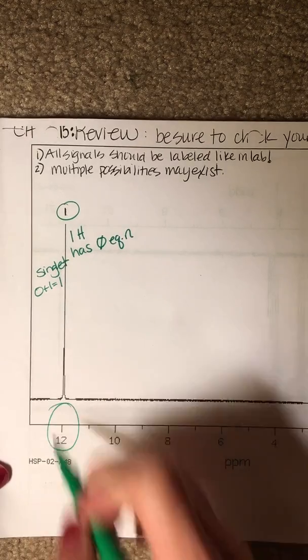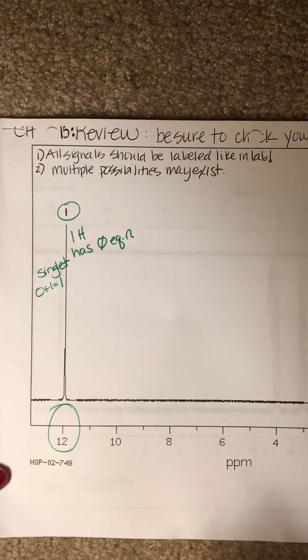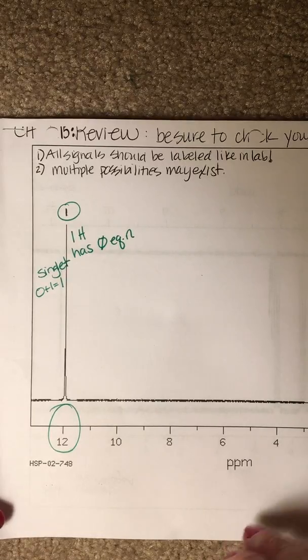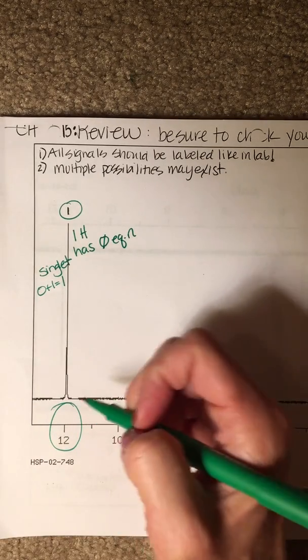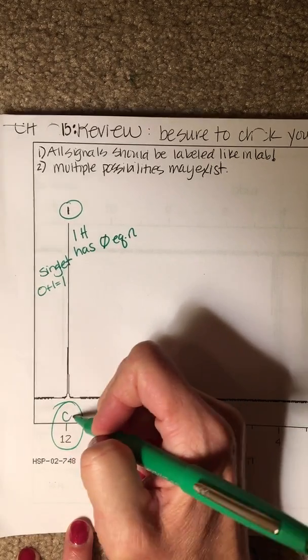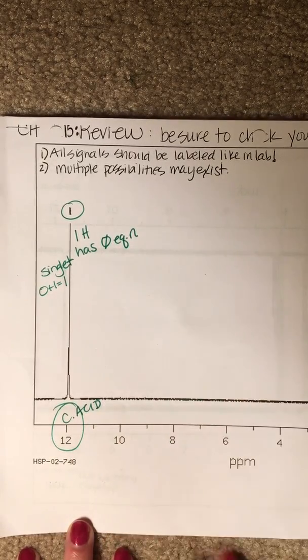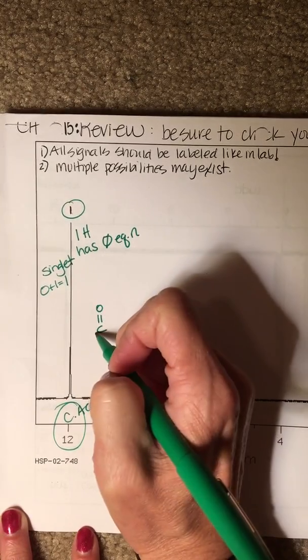And then this shift right here tells us a lot of information. So thinking of hydrogens that are super de-shielded, right? Really close to electronegative things. Lone rangers don't have a lot of electron density around them to protect them from the magnet. So it takes a lot of energy to spin flip. Excuse me, still battling my cough, but sounding much better. This is our carboxylic acid region. So just maybe writing down a little piece of our puzzle here.